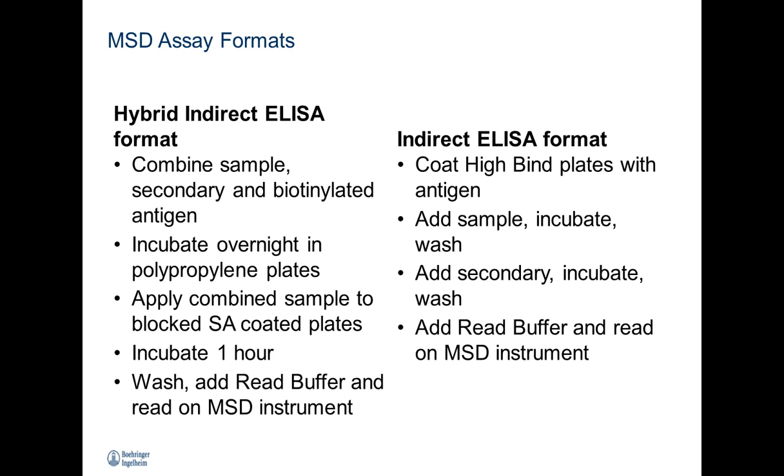The following day, that combined sample and detection reagent are applied to blocked streptavidin-coated plates, a 1-hour incubation, a standard wash protocol, add the read buffer, and read on the MSD instrument. Ours is a Sector S600.